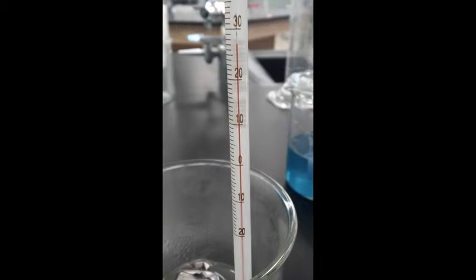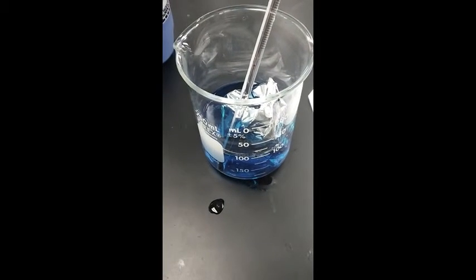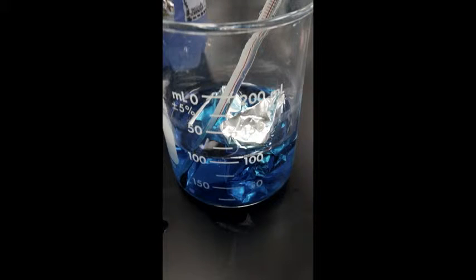The copper(II) chloride showed an exothermic reaction, resulting in a temperature change from 20.5 degrees Celsius to 27.5 degrees Celsius. In the copper(II) sulfate, there was little reaction that took place, but the temperature still changed from 20.5 degrees Celsius to 21 degrees Celsius.